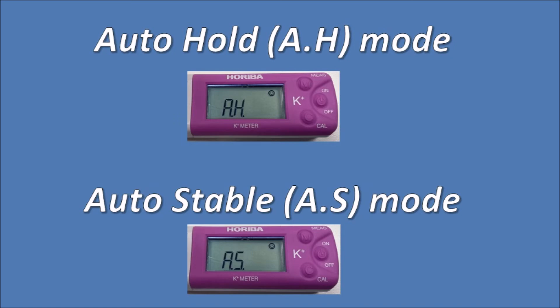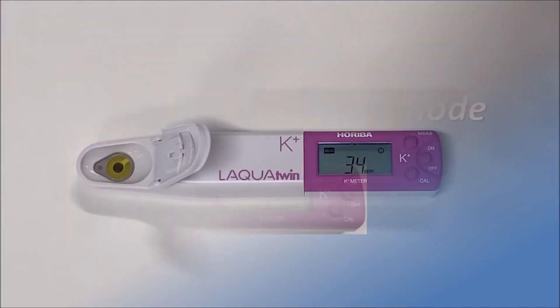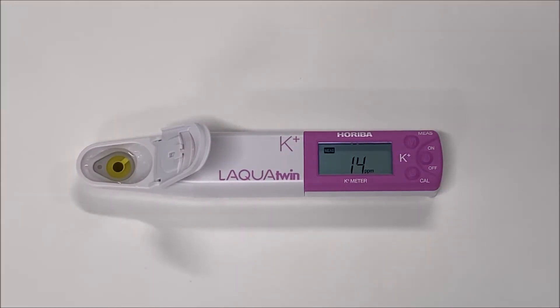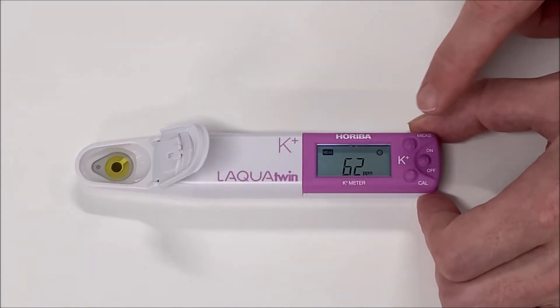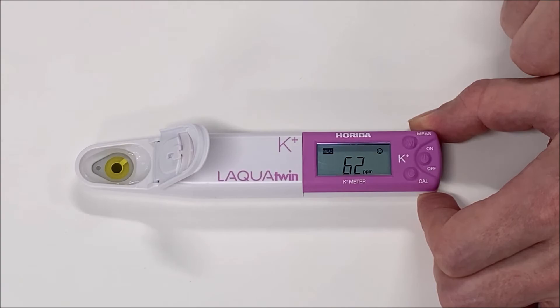There are two different measurement modes on the Laqua Twin Meter: Auto-Hold and Auto-Stable. Auto-Stable is shown as AS on the display. In this mode, the smiley face appears when the value is stable, but the meter continues to measure the sample. The smiley face disappears from the display when the sample value changes, and reappears whenever the reading is becoming stable again. In Auto-Stable mode, press the MEAS button to switch between the reading value, temperature value in degrees centigrade, and the MV signal of the electrode.